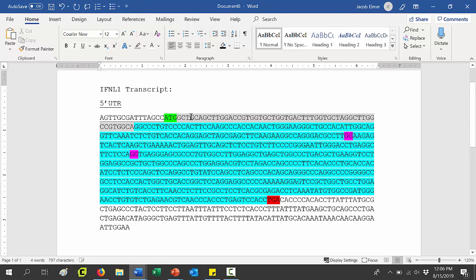So very importantly here, I would not want to cut in either of the UTRs. You can see there, if I make a mutation in the UTR, it's not going to affect any of the amino acids in the protein. Likewise, I'd also prefer not to mutate the signal peptide here either. Now, if you made the right mutation, maybe you could prevent this protein from being secreted from the cell, but it would still be expressed. Instead, I would like to have a different type of mutation somewhere here in the mature peptide that completely disrupted the protein or prevented it from functioning properly.